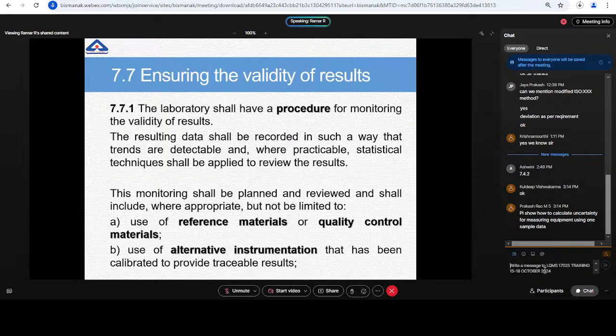Yes, it's only precision, but we cannot say anything about the accuracy of the results. That is very critical. Precision and accuracy are both important for any result, but the samples given to us are unknown, so the value is not known to us, and we cannot measure the accuracy of a result. Of course, we can measure precision by repeating, but accuracy we may not measure.